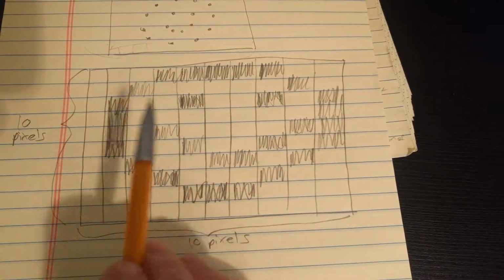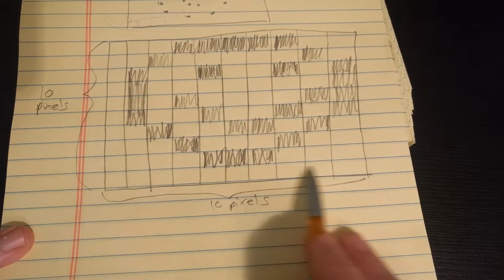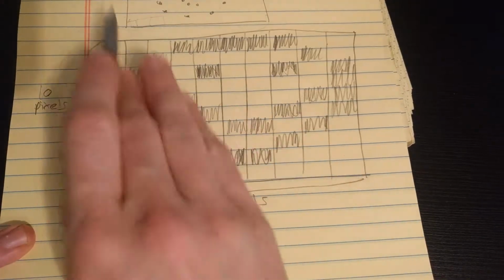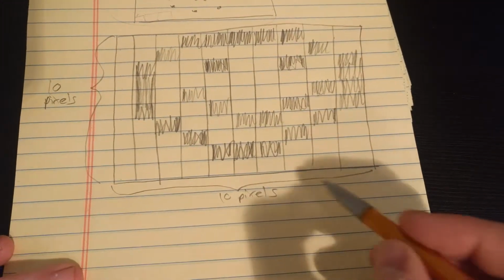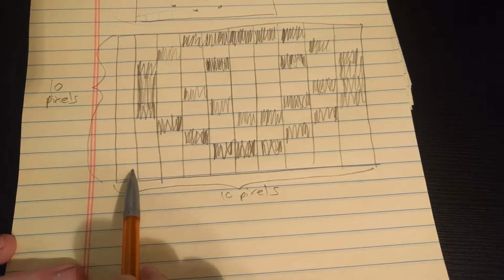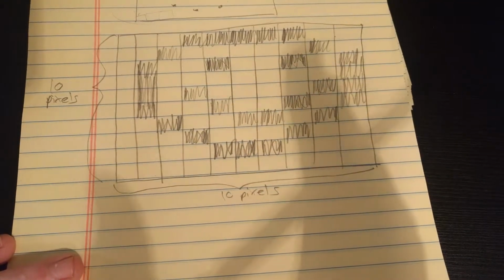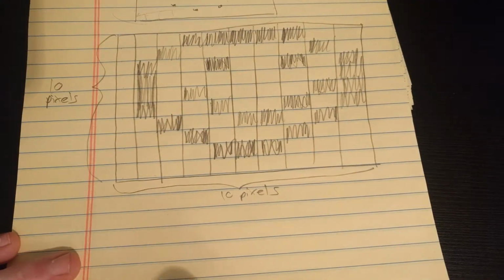So, we might end up with something like this if we repeat what we just did, and in this case, we took 10 spectra on this row, then we moved our laser here, took 10 spectra, repeated that 10 more times. So in total, we collected 100 spectra, and within each pixel here is the amount of intensity that was at the 1700 wave number mode.